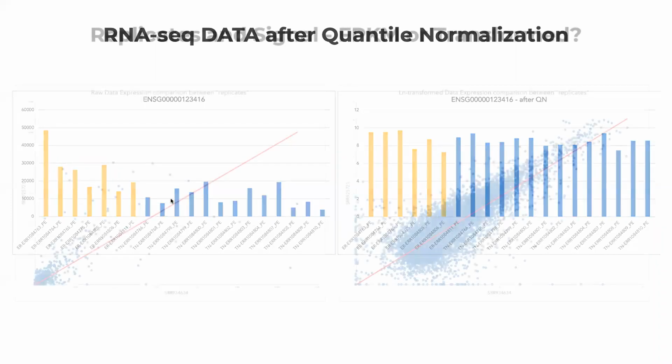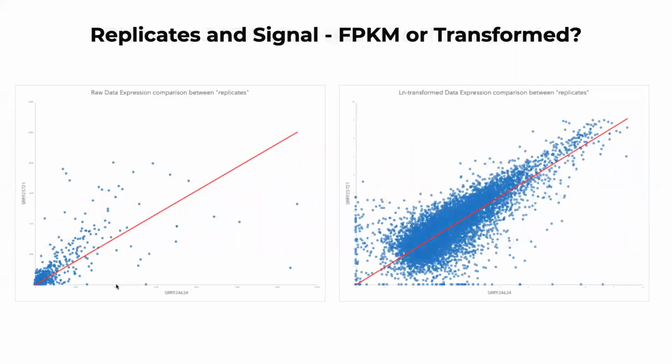Also, it's important when we want to compare what we talked about, correlation within the same group of samples. So here we have one sample in raw scale. Here's another sample, or two samples from the same group, right? And you can see the distribution of your values is going to be much better when you look at it this way.